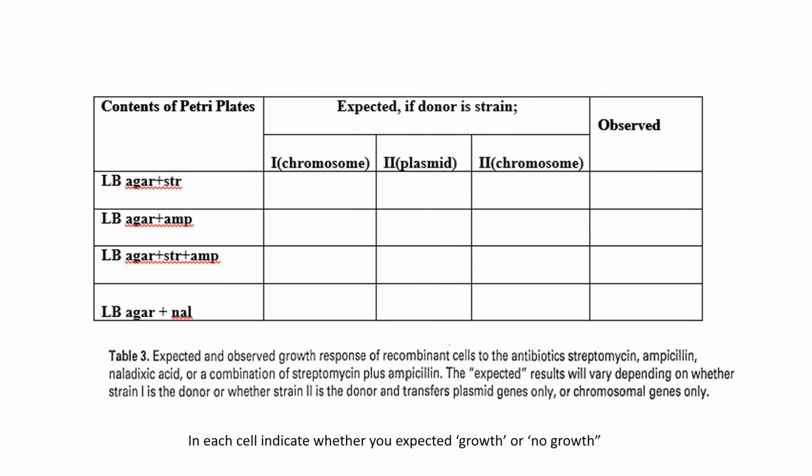In the last column, your observed results are indicated. Pause the video and look at the results from day 3. Once there are bacterial cells or colonies seen growing in any one of the 5 sections or on all 5 sections of the plate, then this would be regarded as there being growth. Observe and record for all 4 plates.